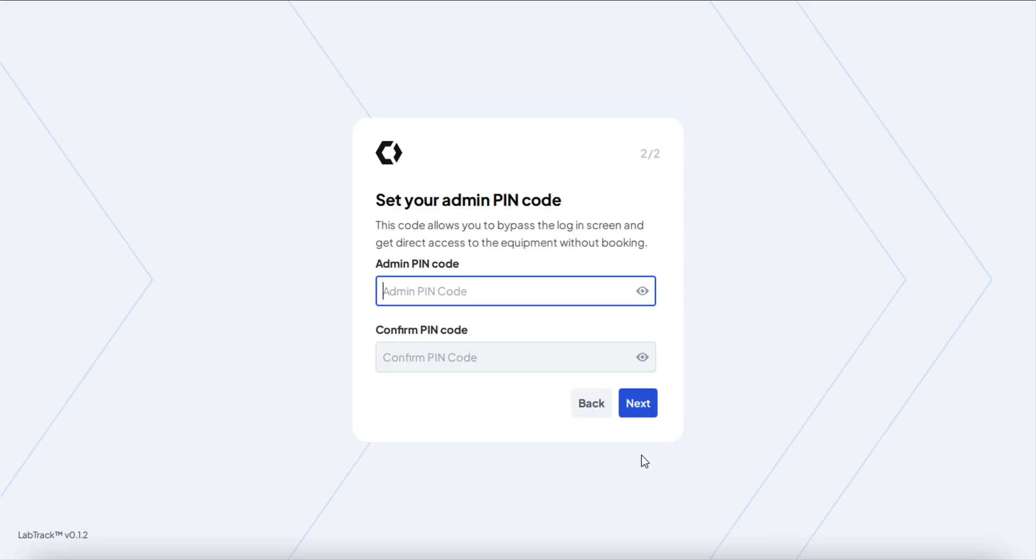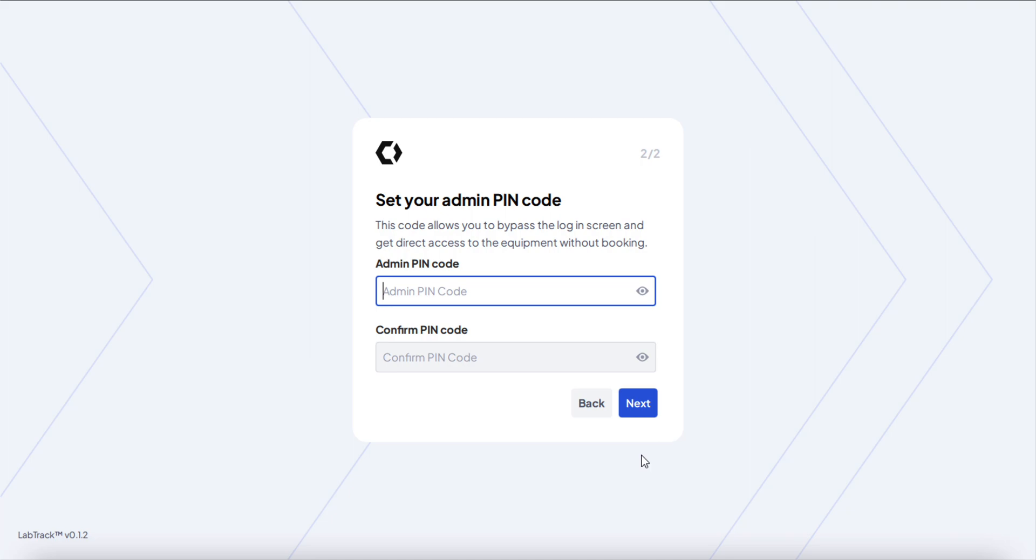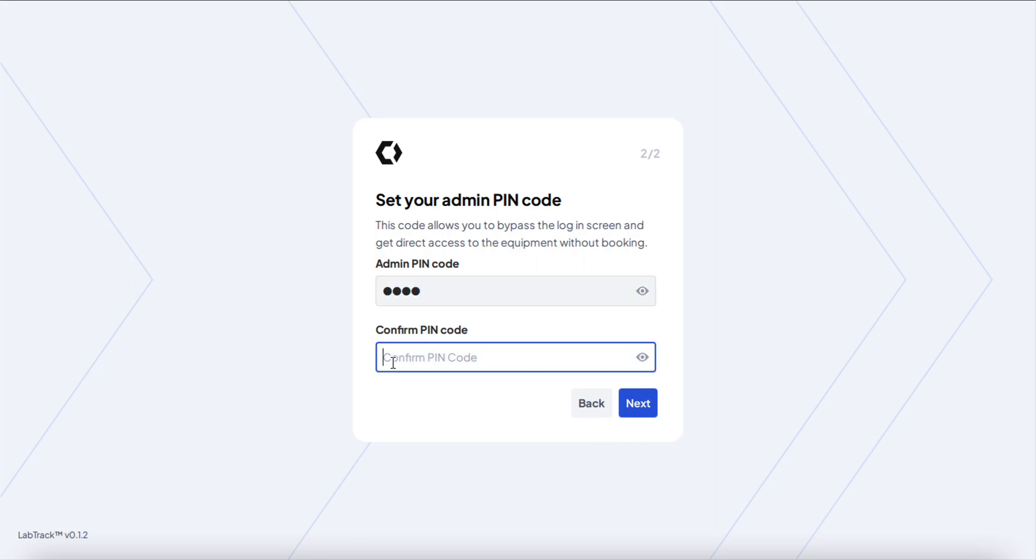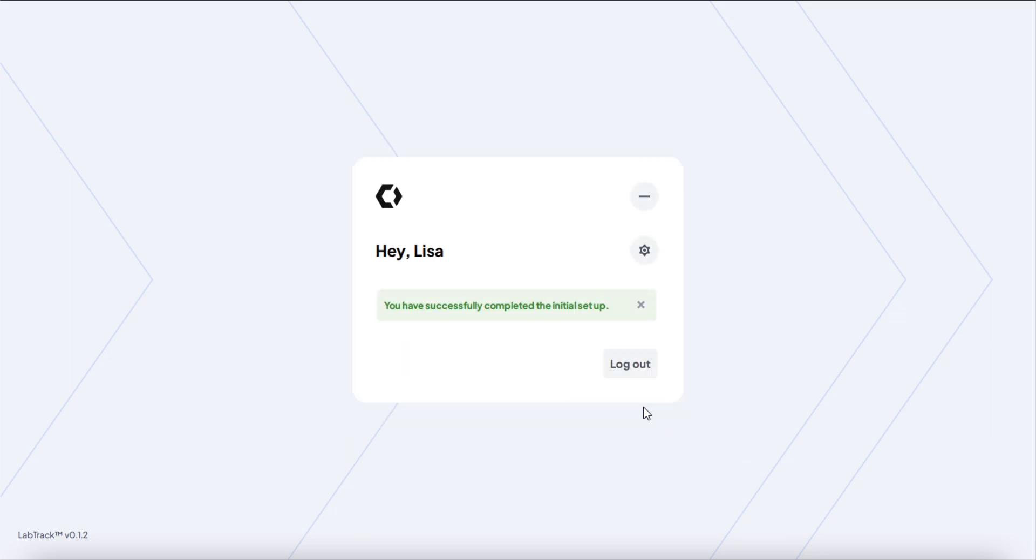After that, you're able to set up your admin PIN code. This is a code that allows you to bypass the login screen so you don't need to log in. Let's say you need to do some software updates on the PC, or you need to uninstall the app because the PC is going to get retired, or whatever you need to do on the PC that you don't want the session to be tracked. Just create an admin PIN code that you can use, and I'll show you where you use it.